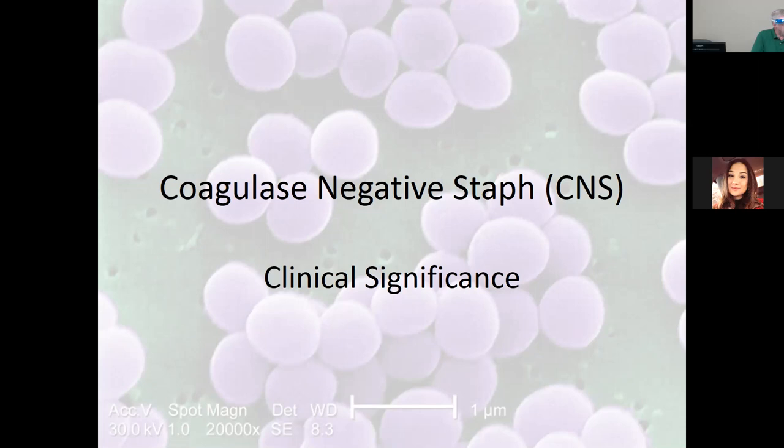So here's our coagulase negative staph, and this is everybody but who? Staph aureus.